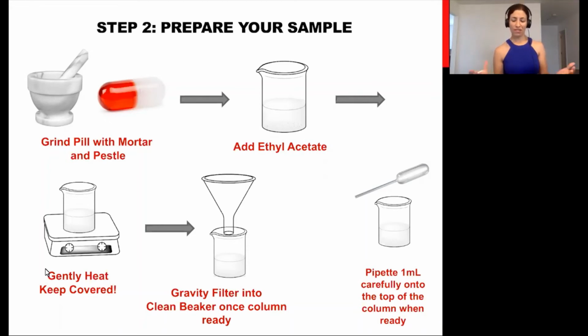You will notice that some of the components within the pill are not soluble in this organic solvent. Think about what those might be and why, for a pill that you're ingesting into your body, it might be advantageous to have those be water soluble. Once we have isolated these organic soluble components, we'll have some solids, so the insoluble solids left over. We don't care about those. That's not where we're going to find the acetaminophen and the caffeine that we're looking to separate by chromatography.